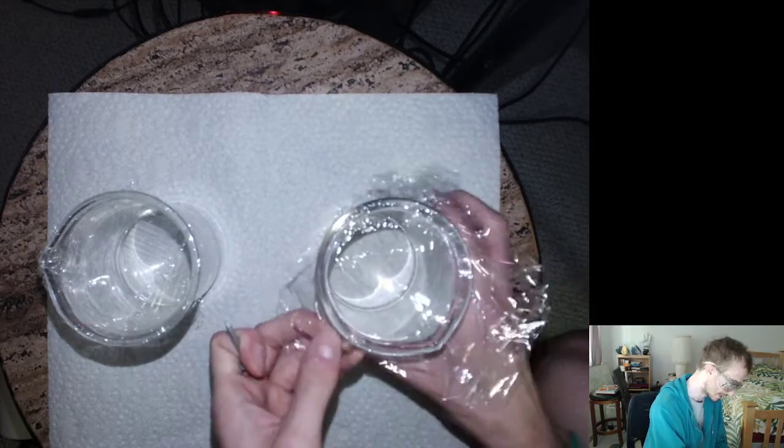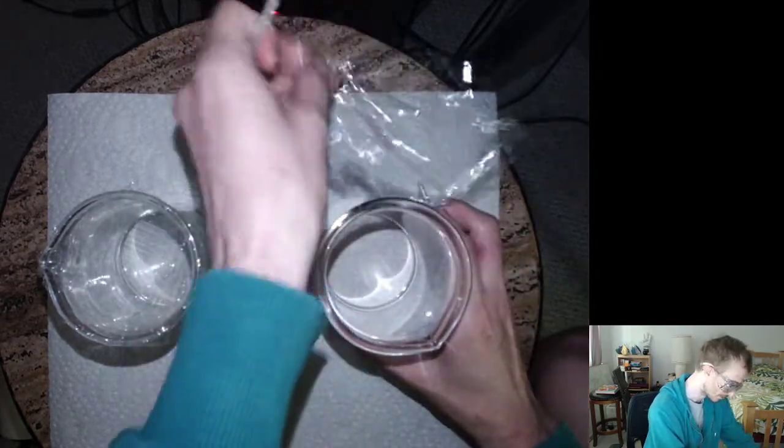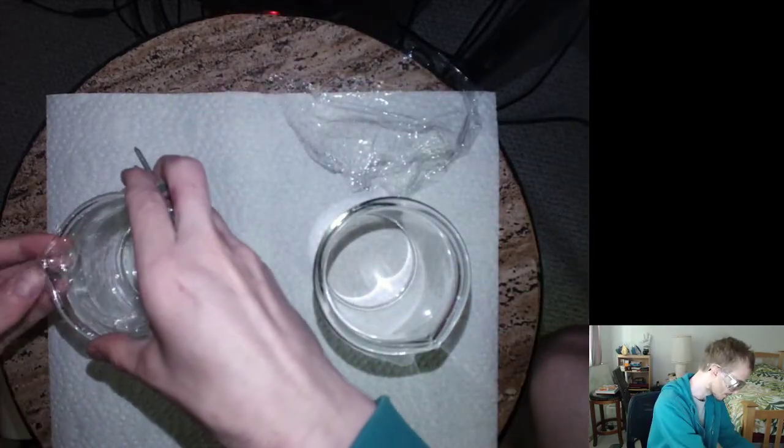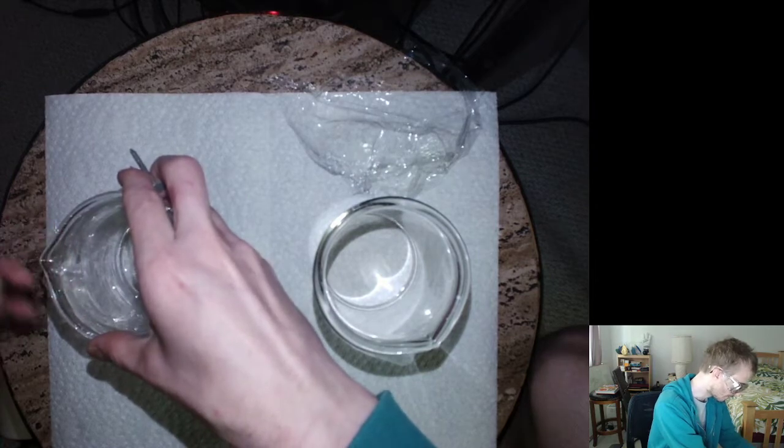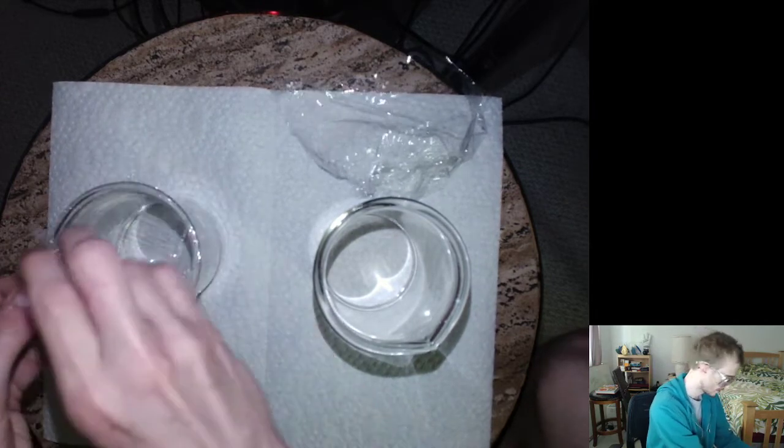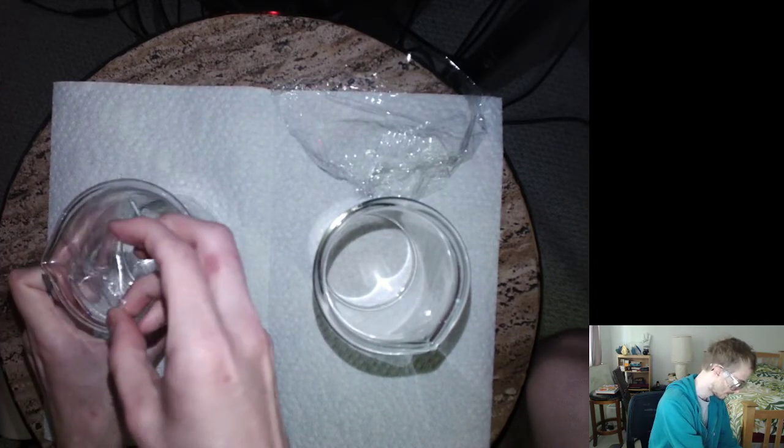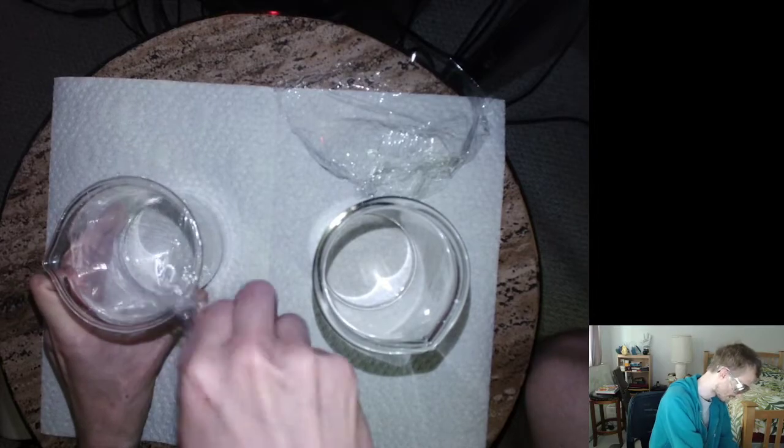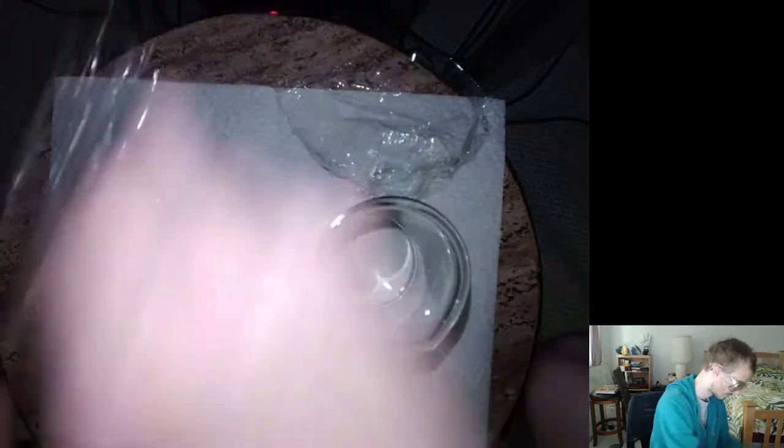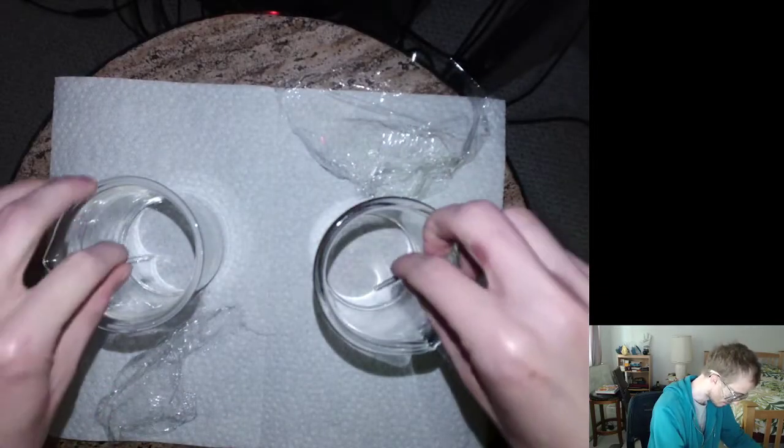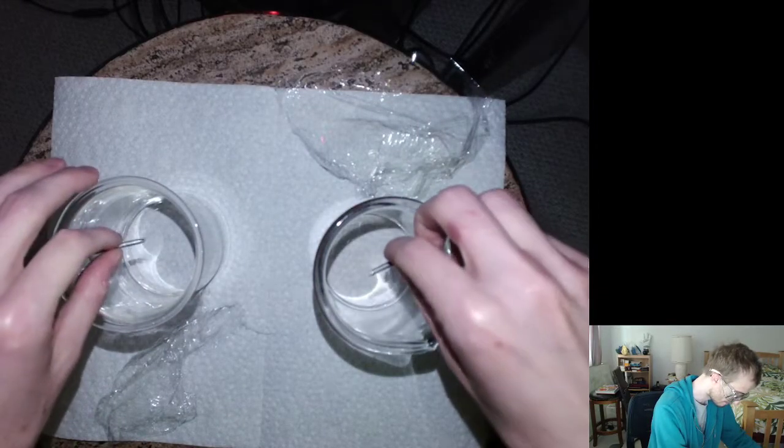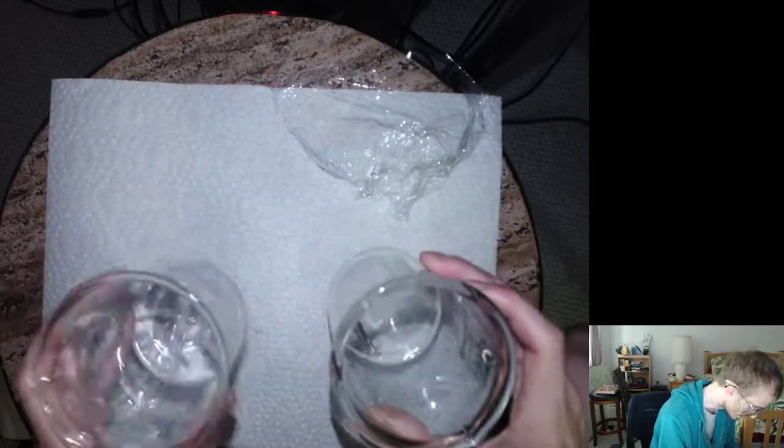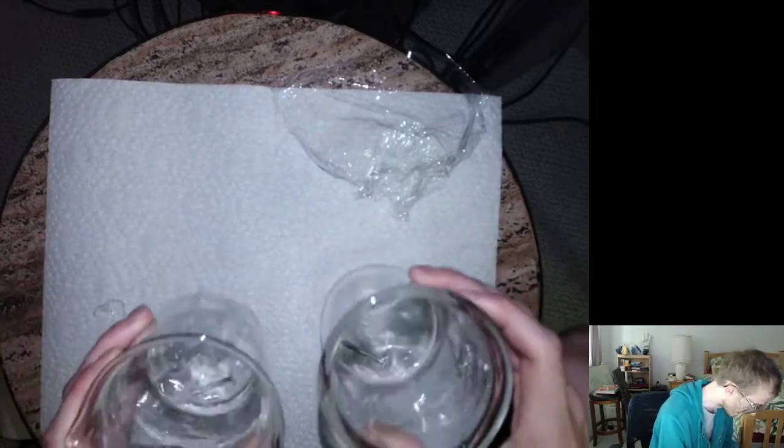I'm going to add a nail to each of these, and we're going to see if one of them manages to bubble. So just take off this film here, drop them in both, and see what happens.